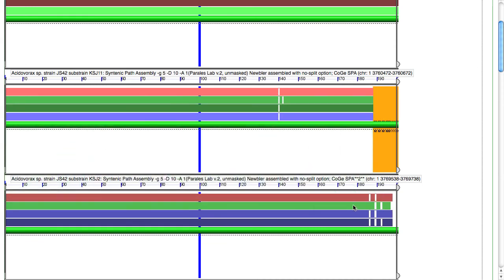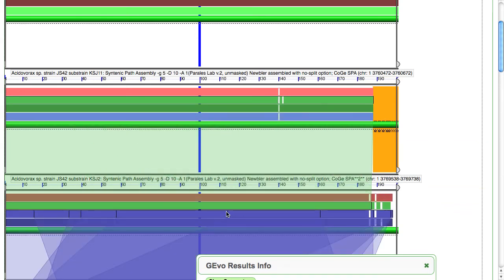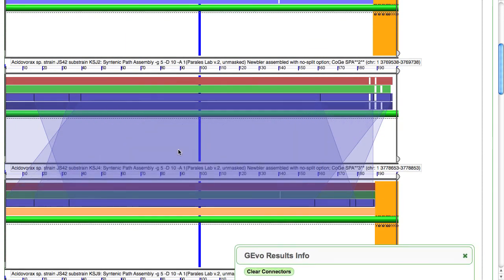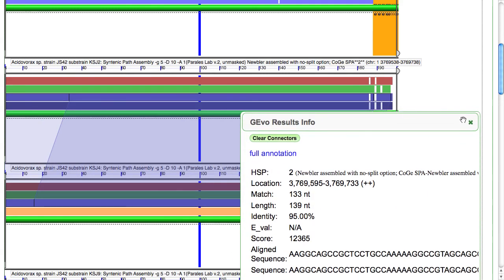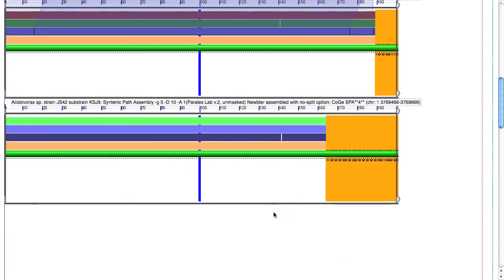I see that there are lots of local regions of repeats where these things are matching itself multiple times in multiple areas. And I can see that that pattern is repeated among all these different regions. So whenever you have sequence that contains local repeats, this can severely impact the assembly algorithms because it's unable to accurately place each individual sequencing read, and you can get some errors.